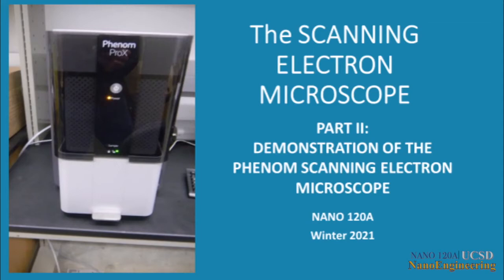The Scanning Electron Microscope, Part 2, Demonstration of the Phenom Pro-X, Nano 120A.